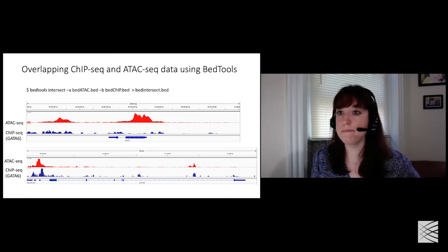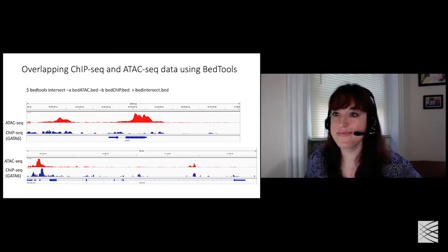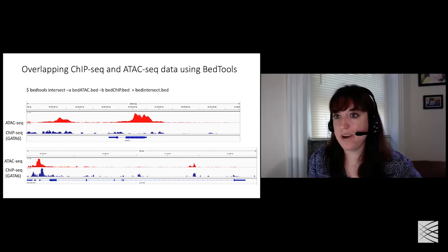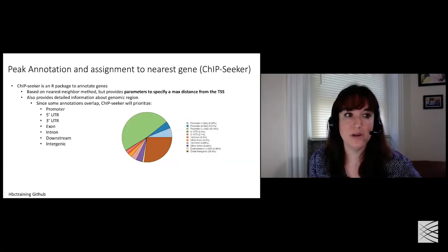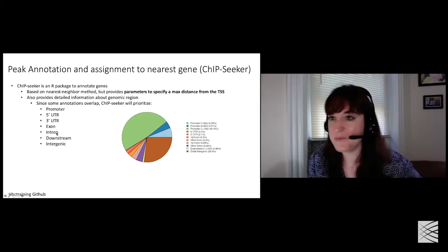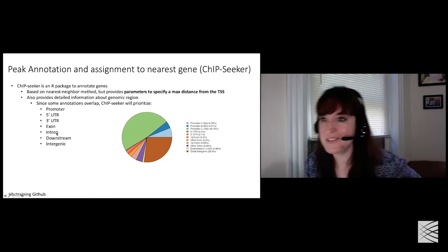Lauren, there is a question, sorry, just to go back to your last slide: what about enhancers? Why aren't they in your rankings of output? So we tend to prioritize enhancers as intronic regions, and so they would be included here. So they are here. I guess I can make that a little more clear next time I give this talk. So thank you for the input.